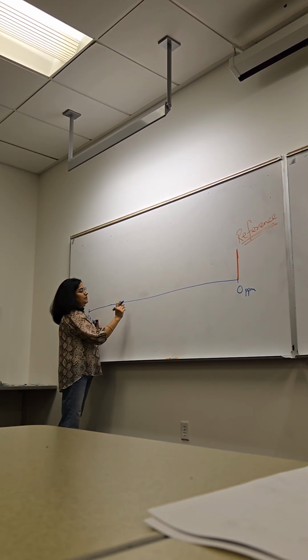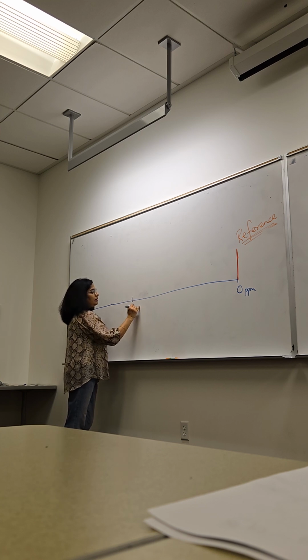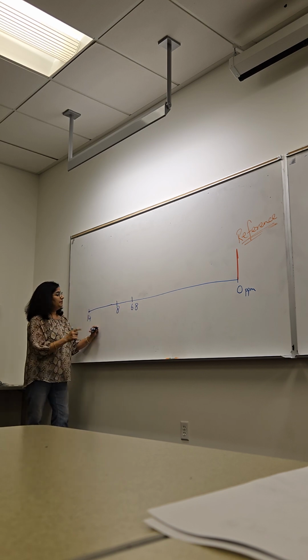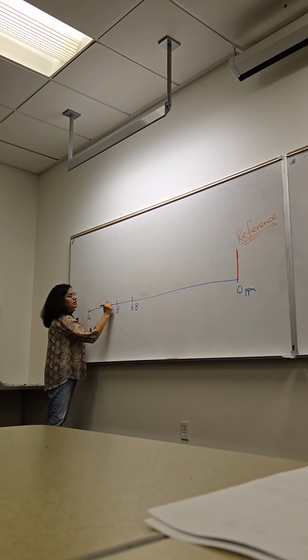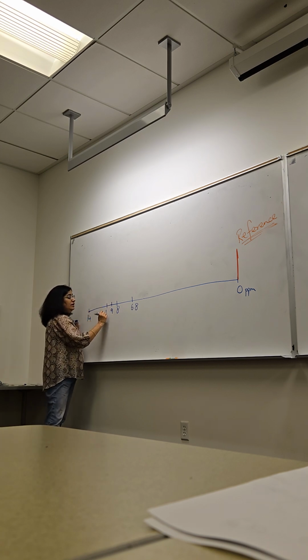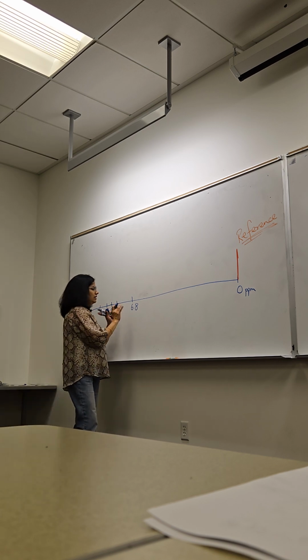So I love the 6.8 to 8 zone area in here. Then I find the 9 very helpful. And then I find the 10 very helpful, and then anything above 12, those are really helpful, and I'll tell you why in a second.